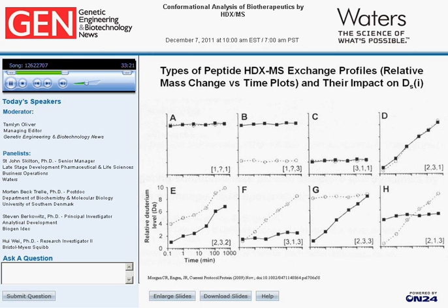At H, where the actual crossing occurs, the difference where we sum the differences for each peptide time point could give us a little problem, and we'll have some alternative ways to deal with that. So this is generally the kind of scheme where we're taking advantage of these different types of deuterium exchange uptake plots in terms of generating these difference data. Next slide.